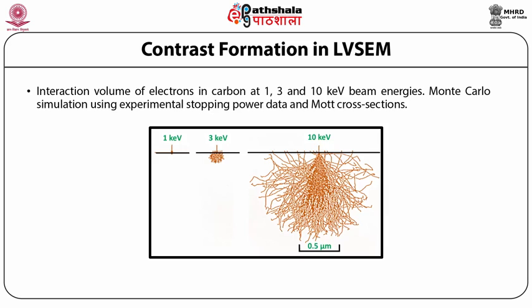be appropriate. It is also evident that the surface contamination marks, scratches, and dust particles, which are barely visible at 10 kiloelectron volt, became dominant for contrast formation in the 1 kiloelectron volt image due to a significant change in the form of the image contrast associated with a subsequent rise in the secondary electron yield due to fall in the electron range.